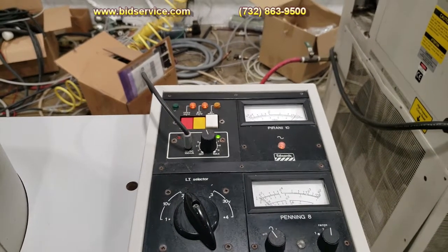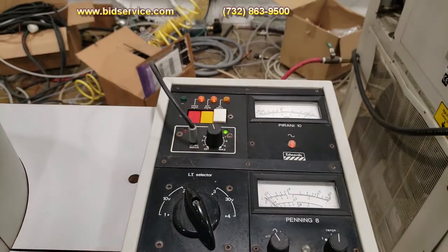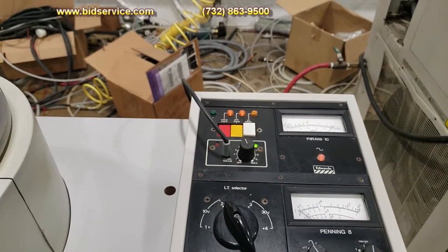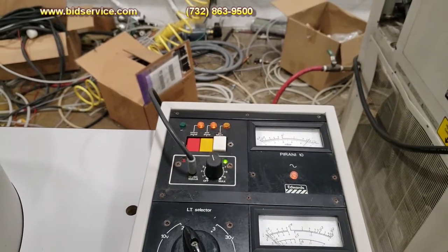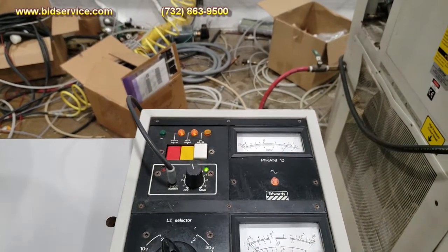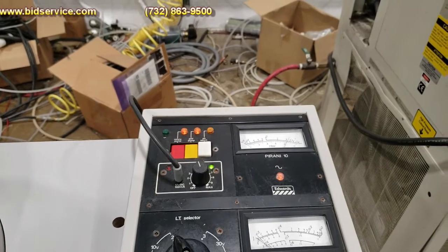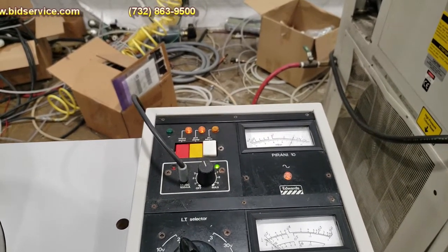The system does run off of 208 single phase at 20 amps, which gives it around 3 kVA — which is what the manual states. You can see my gauge is starting to drop down now. It does require water to run to help cool the diffusion pump.